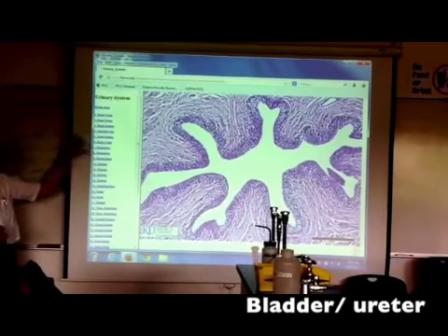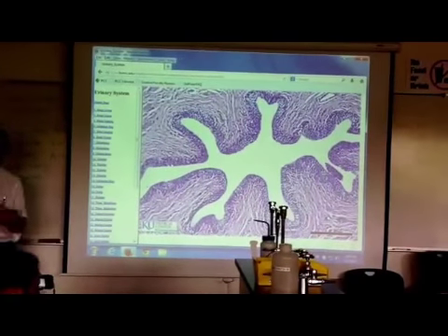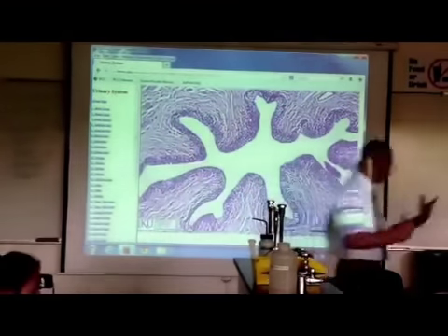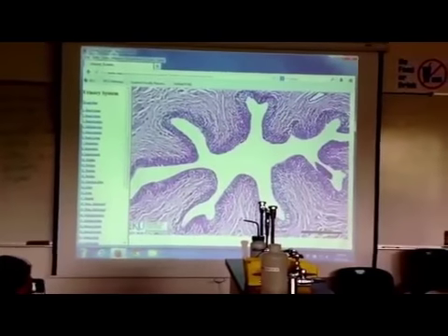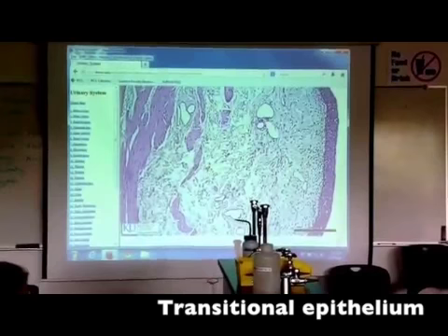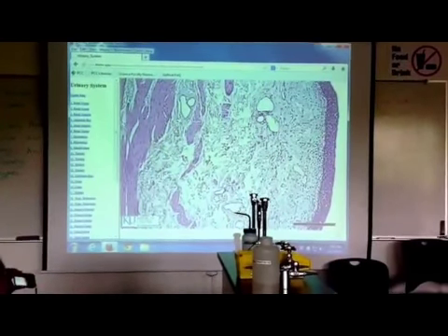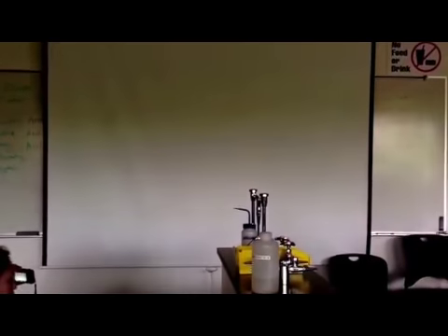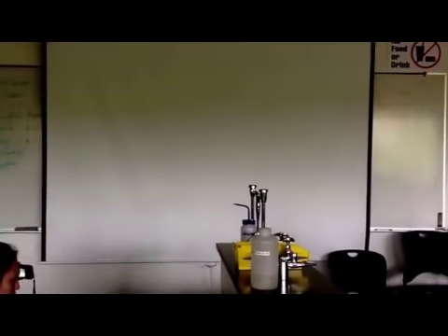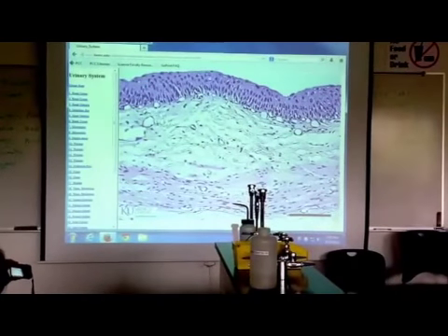So that's actually a ureter because it's star-shaped. So you have to identify transitional when you see it in a ureter or a bladder. So we don't have slides of a bladder or ureter. We still have to be able to figure out that that's transitional. Right? Let's see. So transitional is on the right, because that's where the P is. Right? And this is kind of a bladder they're cutting through. Right? So if you know transitional when you see it, here's another close-up of the bladder wall. Right? So if you can do transitional, tell me where it's found.